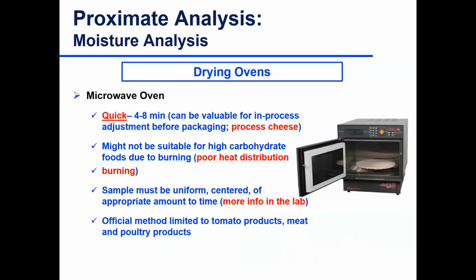Both methods, first and the second, are fairly time consuming. The one with the vacuum is a little faster, obviously. But still, it's a fair amount of time that goes into drying these products. You don't get quick results. It's quite a long process.